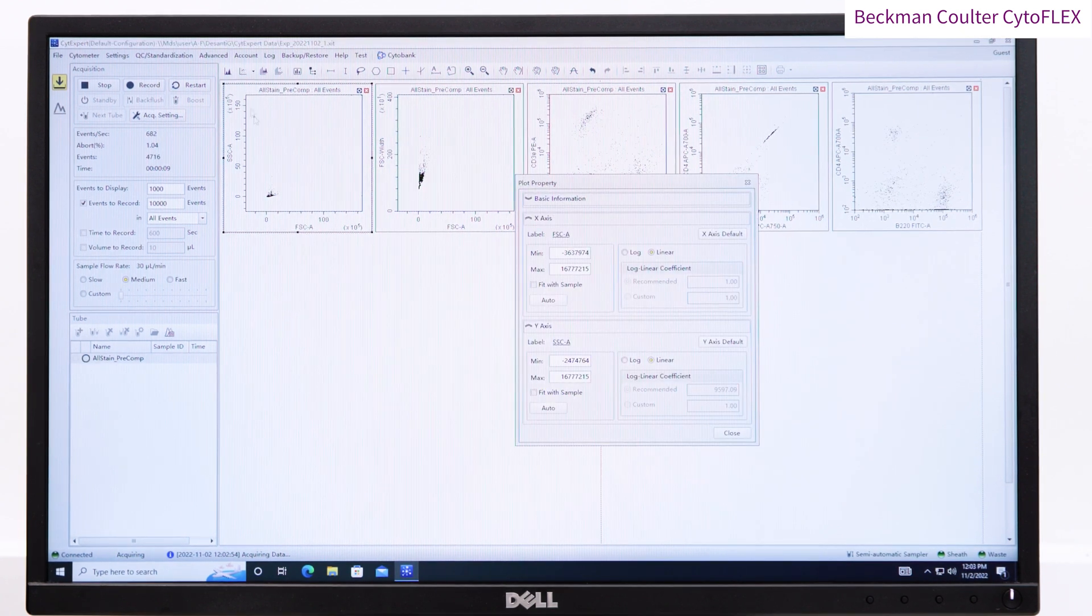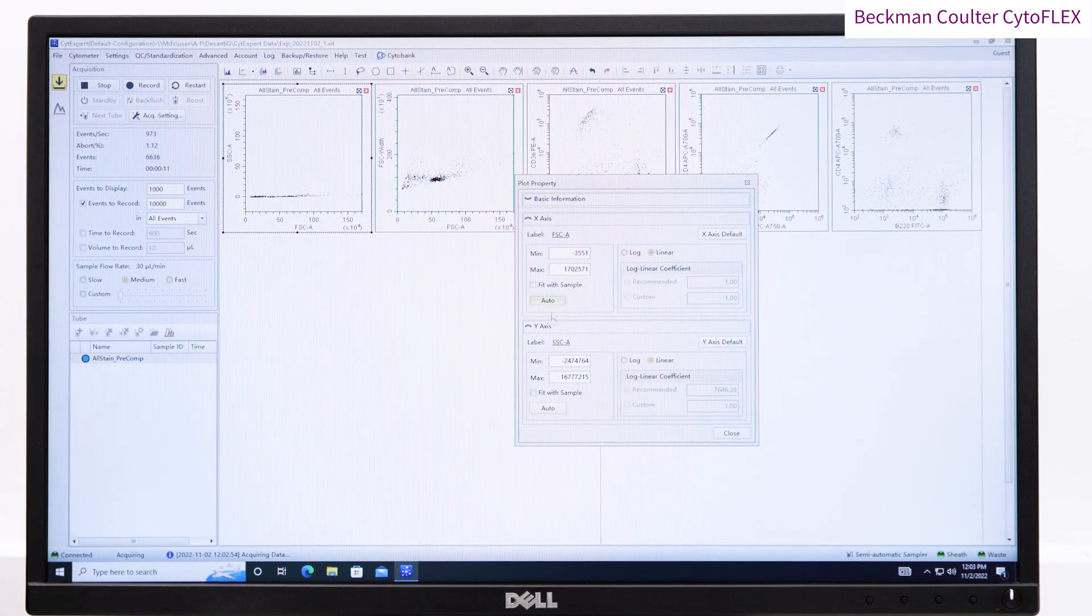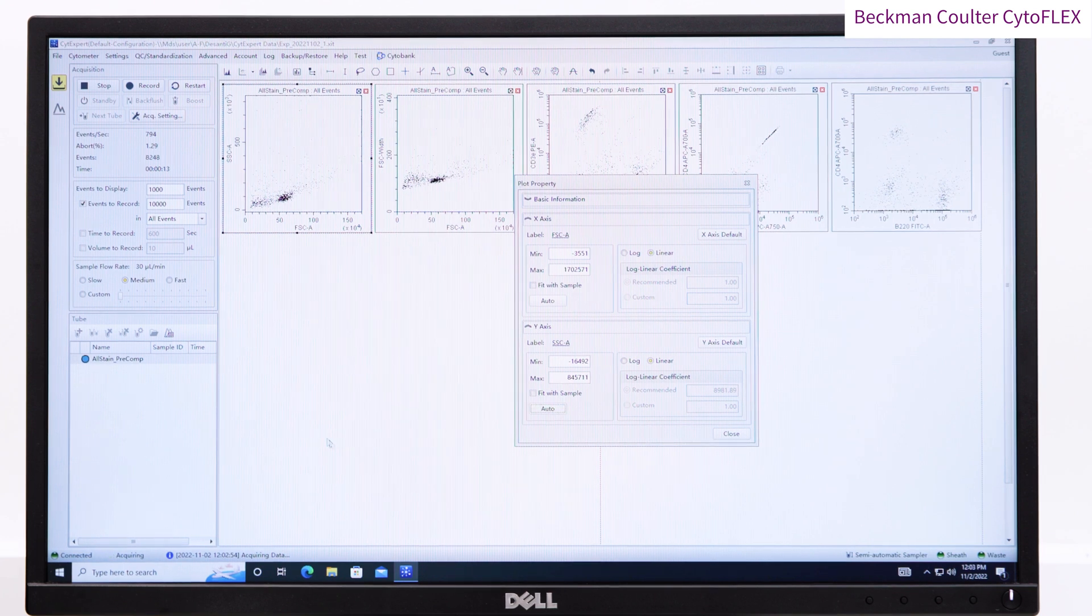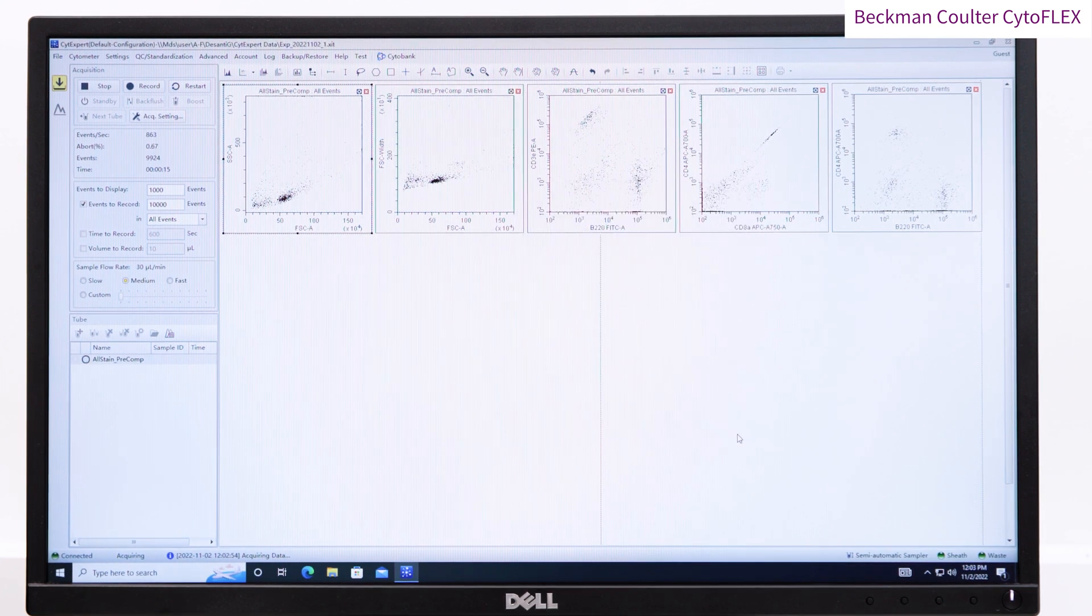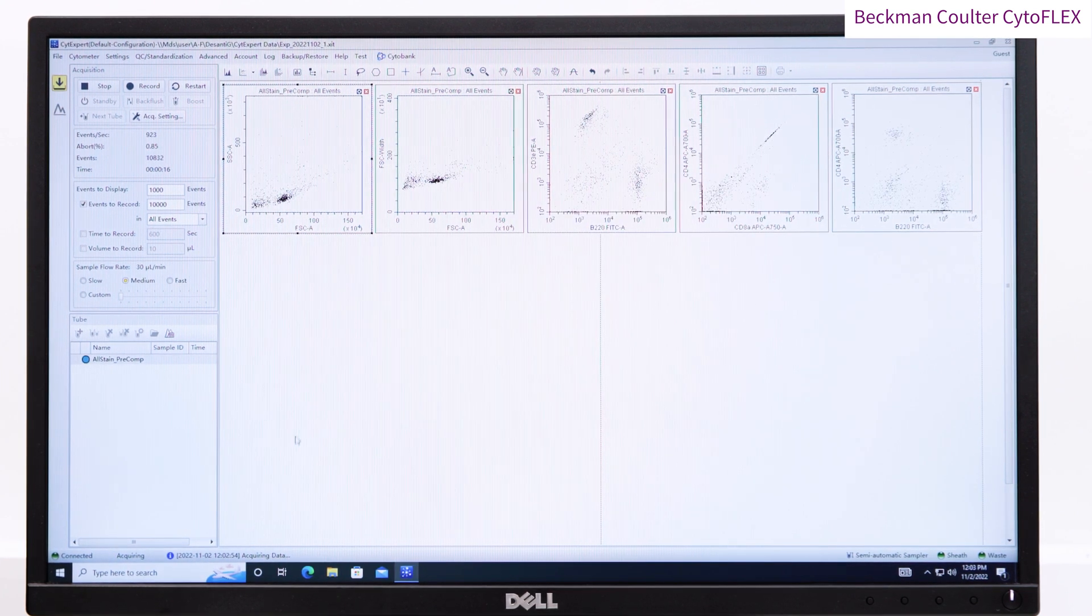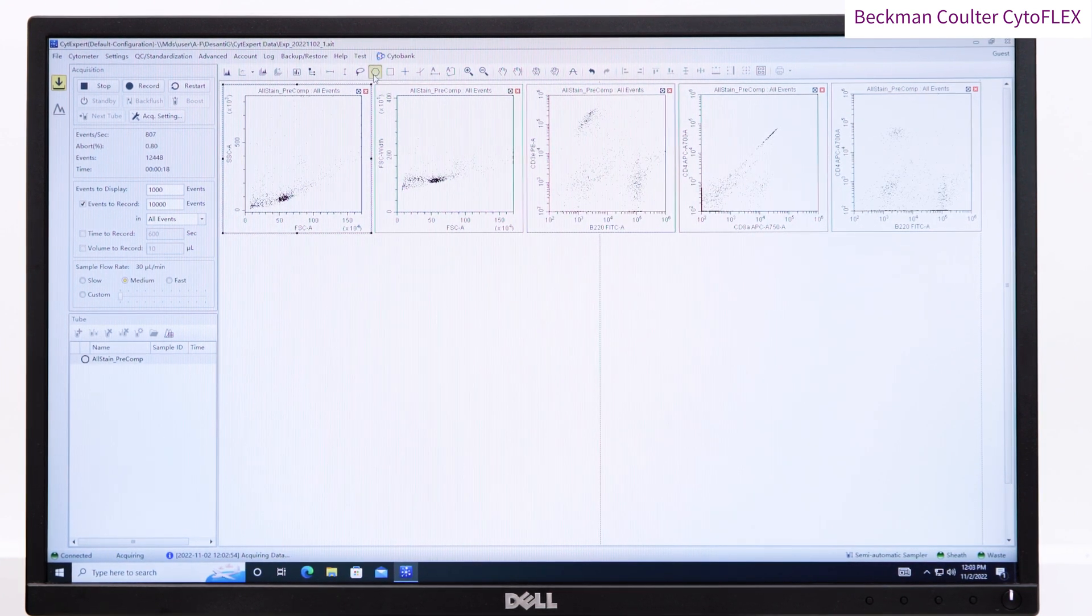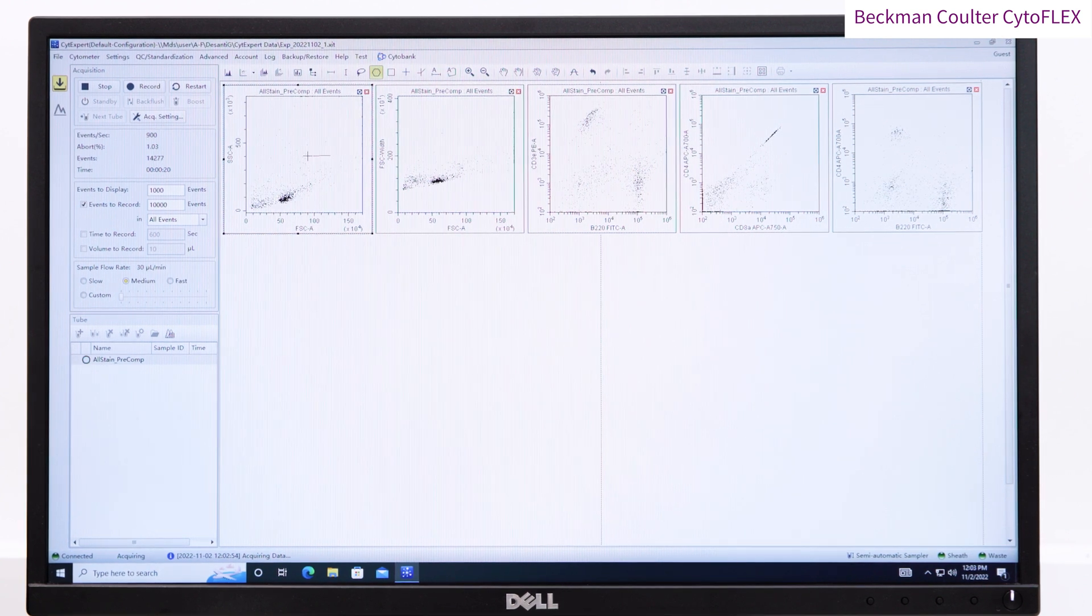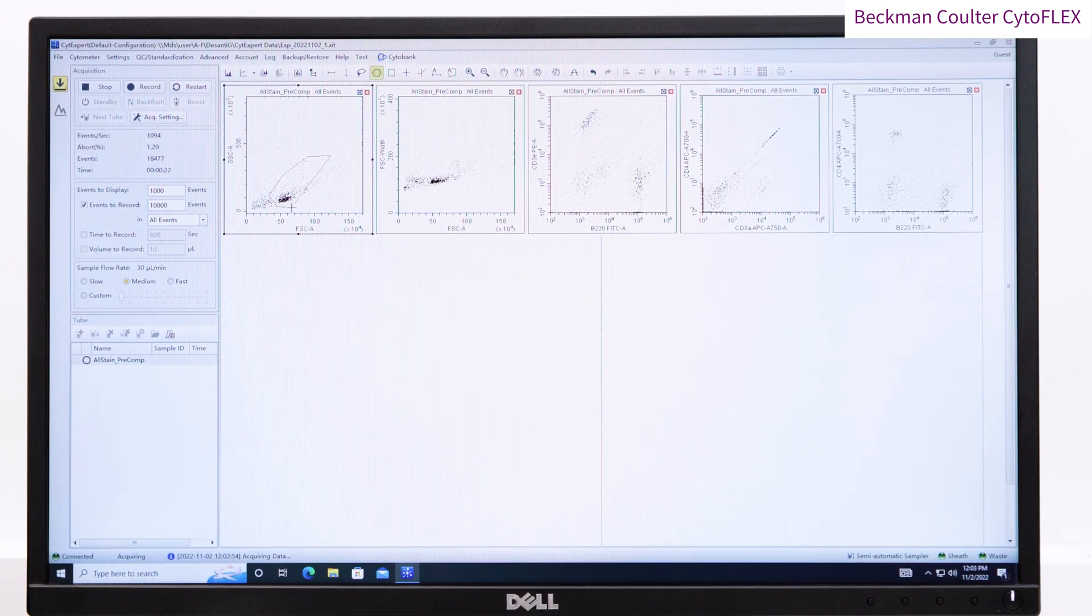On the forward and side scatter plot, adjust the scale by right-clicking and choosing Property and then by selecting Auto for both axes. Gate the cells of interest using a polygon gate and apply this gate as required to all of your plots.